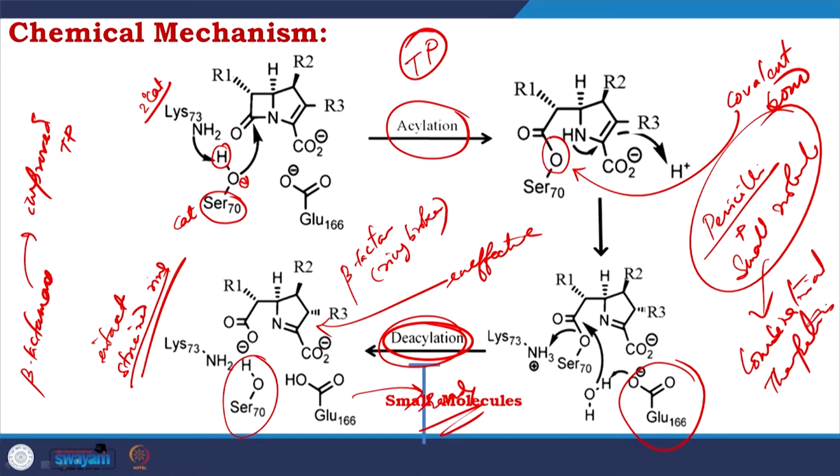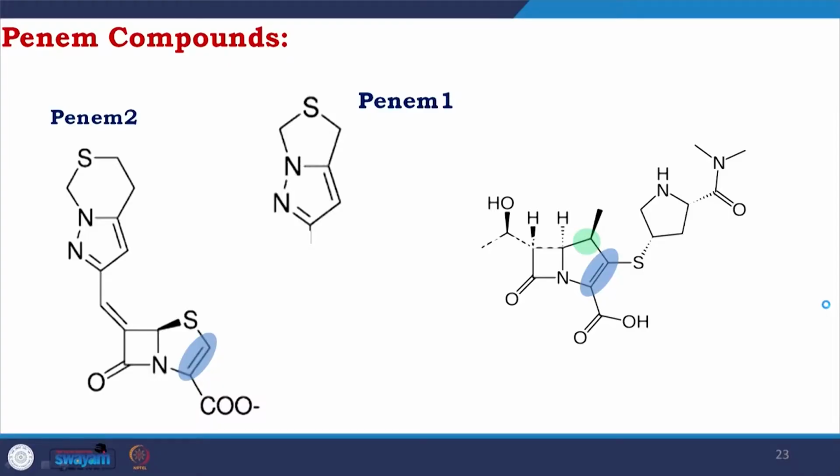So, as I told, in the next phase of my demonstration, you will not only learn how to use COOT, but you will also hear the story of drug designing, how we take help of high resolution structural data to go for drug designing. So, I am talking about some compounds.